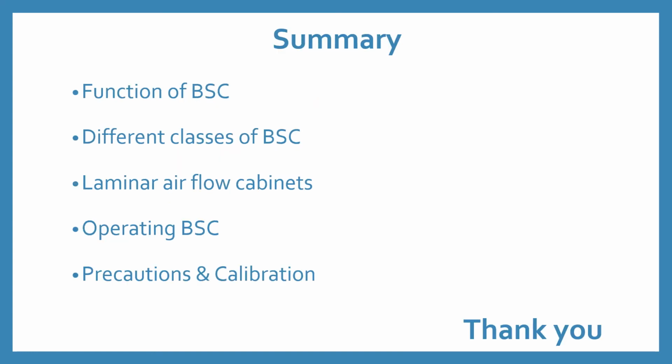To summarize, we have looked at the function of a biosafety cabinet, which is to provide product, personnel, and environment protection. We've looked at the different classes of biosafety cabinets, their working mechanisms, and the differences between them. Laminar airflow cabinets, their uses and their differences from a biosafety cabinet. The steps to be taken before and after operating a biosafety cabinet. Precautions and the different tests for calibration of a biosafety cabinet.